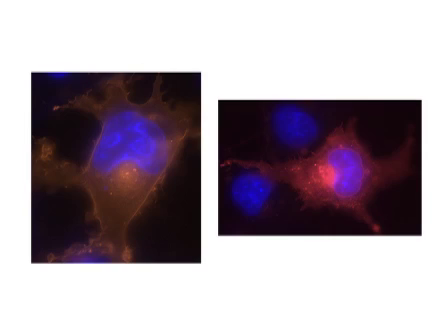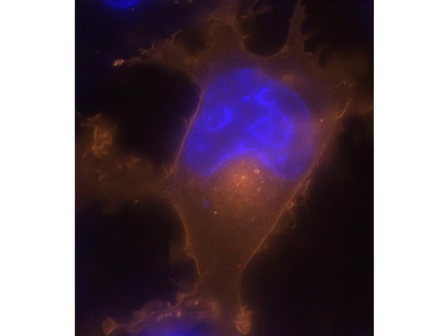These next two images show live COS7 cells transiently transfected with pSNAP-ADR beta 2. Cells were labeled with SNAPCELL TMR-star and counterstained with Hoechst 33342. The pSNAP-ADR beta 2 construct was generated using the pSNAP tag M vector.